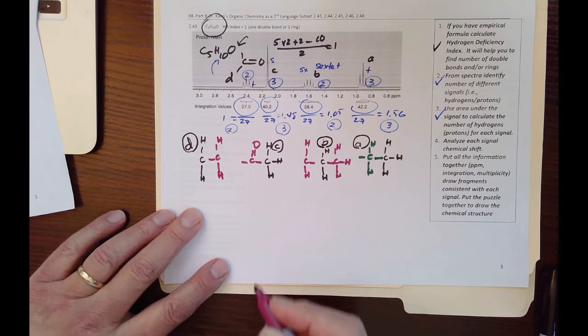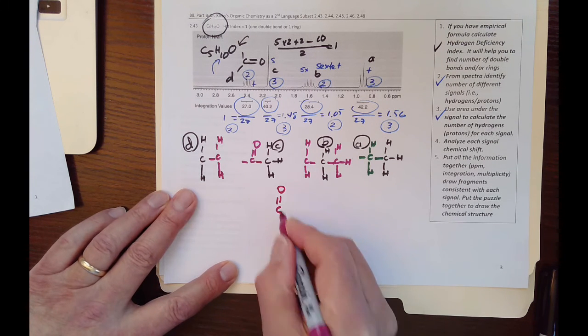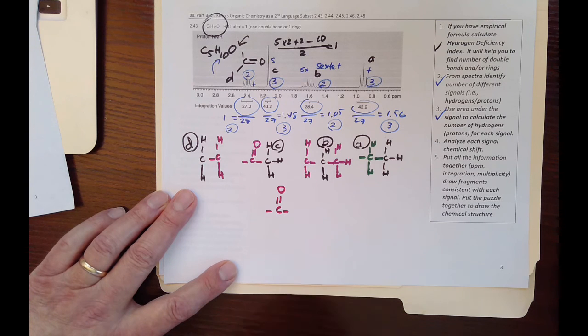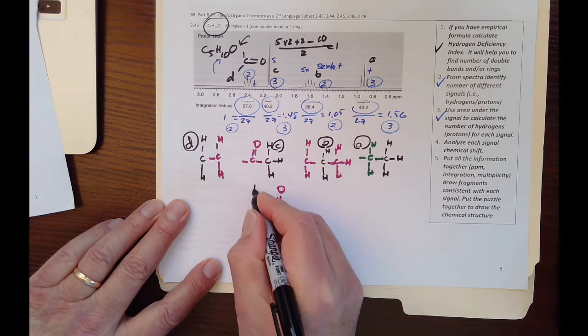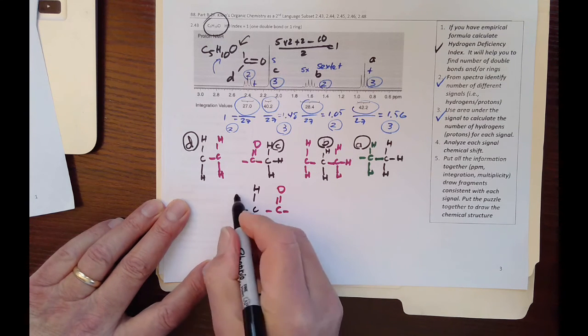We know the carbonyl group, on the left side or the right side, doesn't matter where we put it, has a methyl group, which is the C. Remember the C? I put a methyl group here, and these 3 protons are going to be the C.